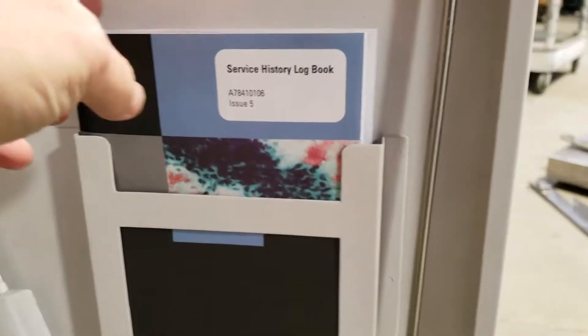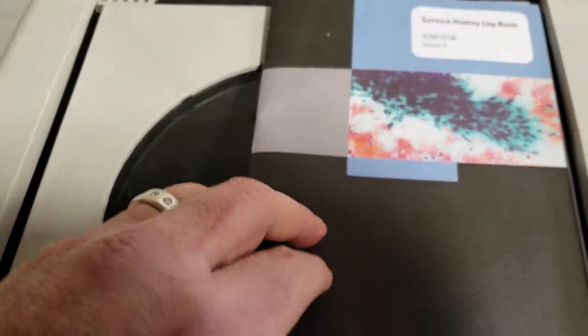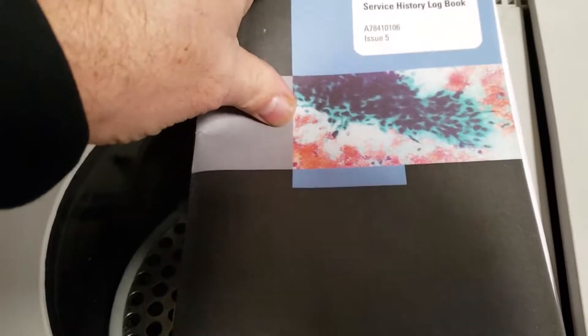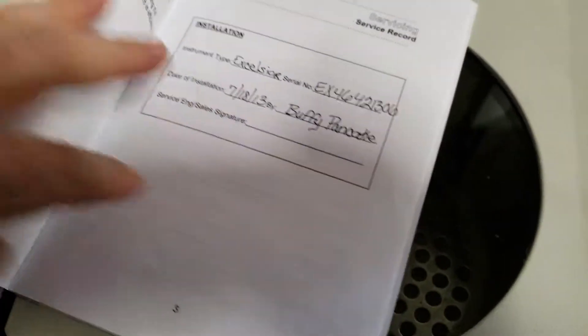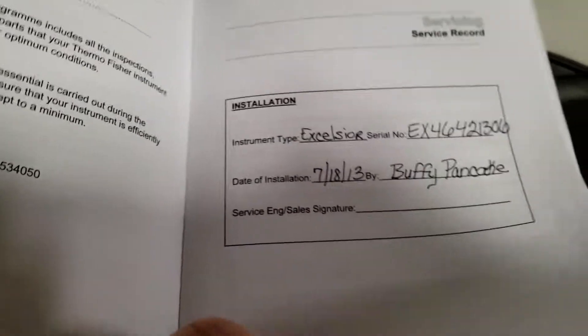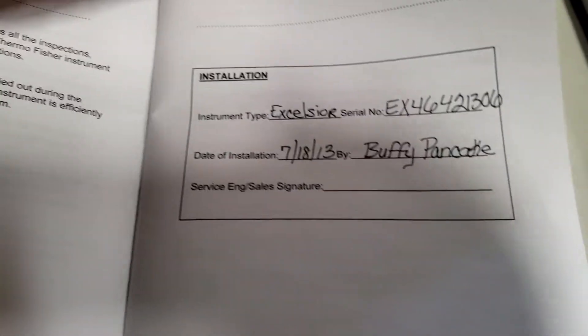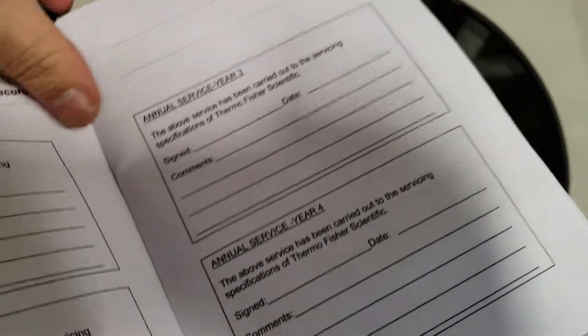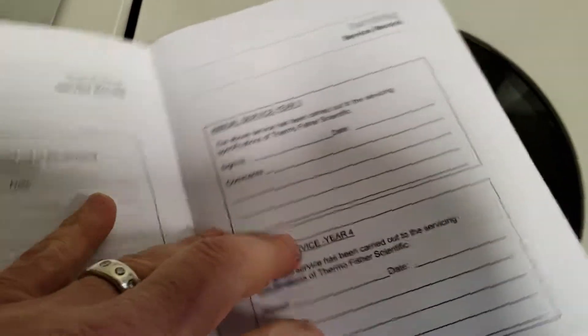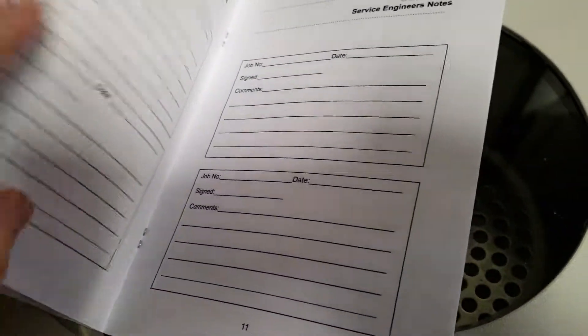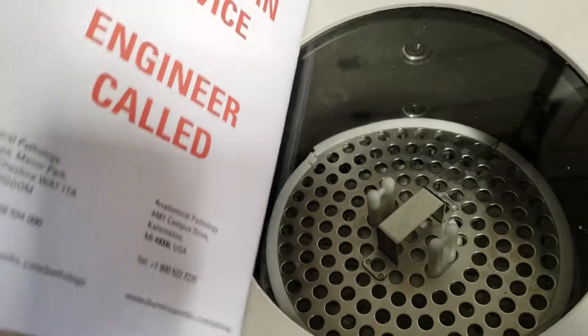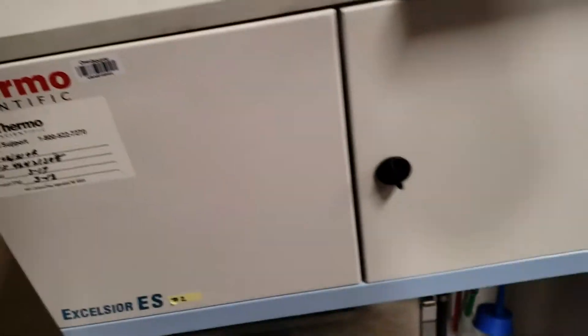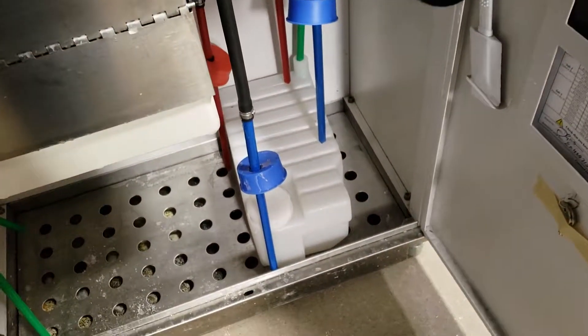Here's the service history logbook. I'll show you some of that. Looks like it was installed in 2013. They never filled this book out again, although they obviously had maintenance done based on the PM dates.